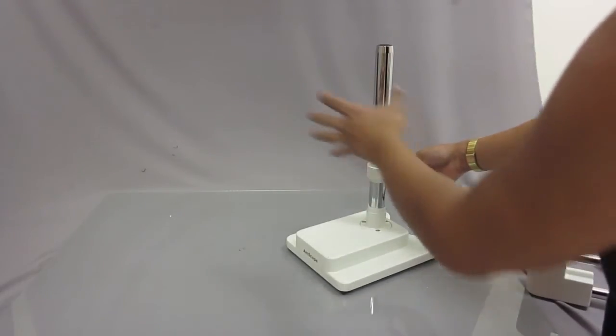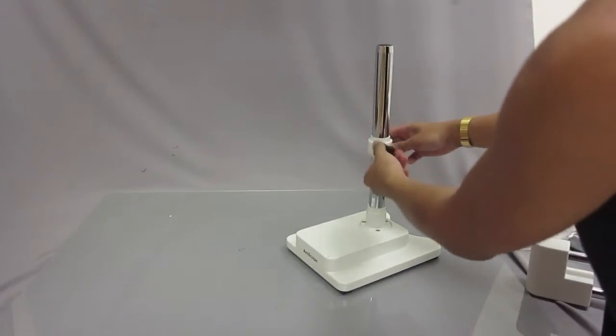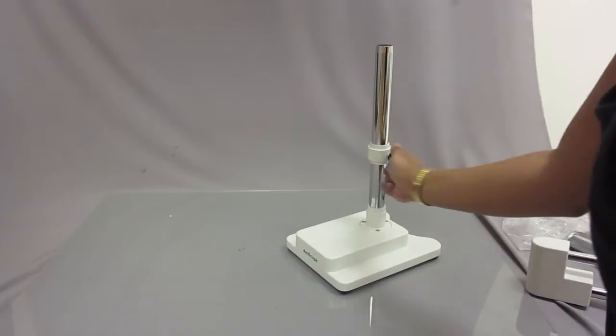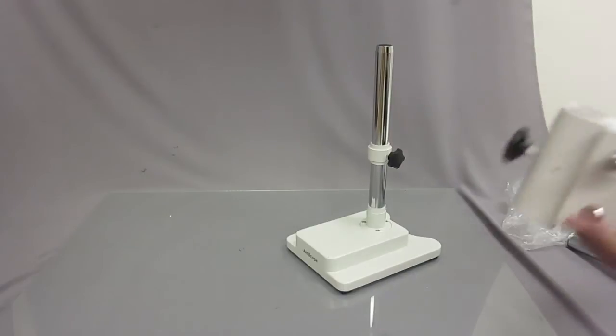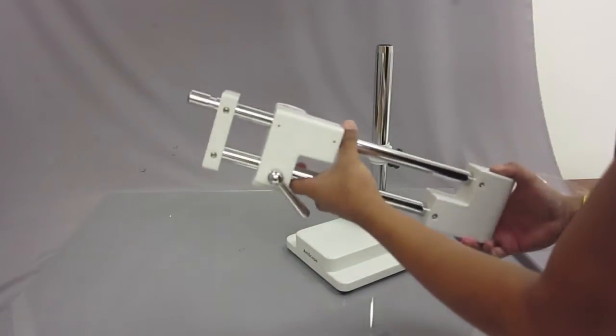This part allows you to adjust the height of where you want the double arm booms to stop. For right now I'm just going to secure it right here — you just tighten the knob until it's secure and it doesn't move anymore.